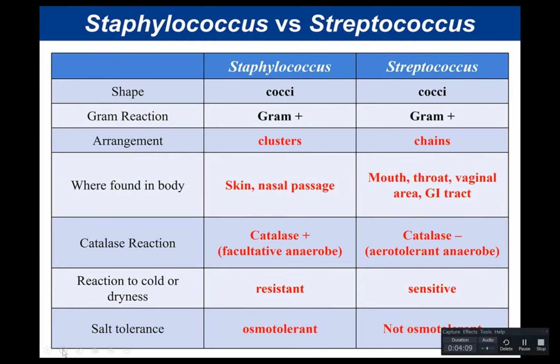And so the reason that the catalase test is on this quiz and on this practical is because it's a way that we can differentiate between Staphylococcus and Streptococcus.